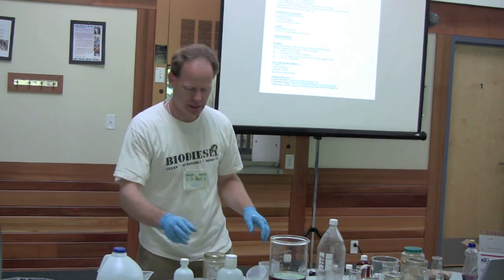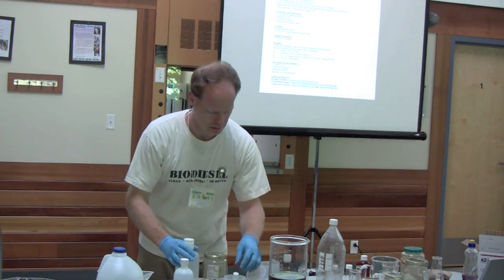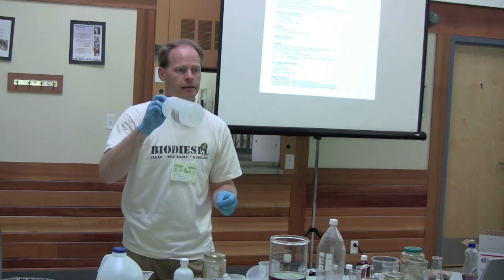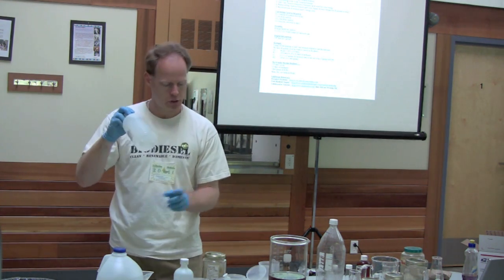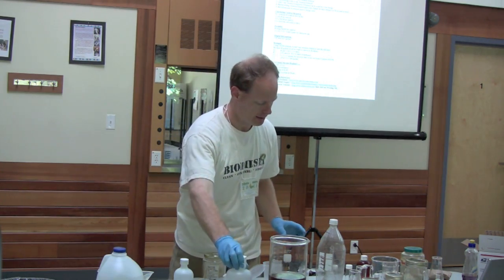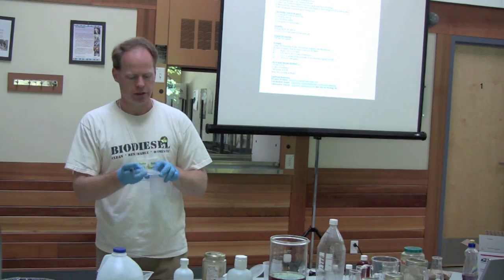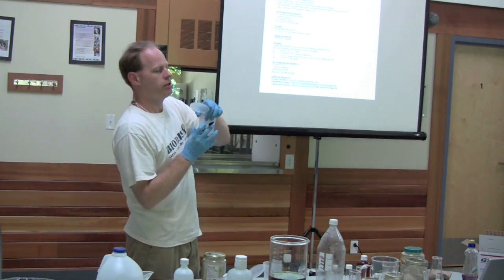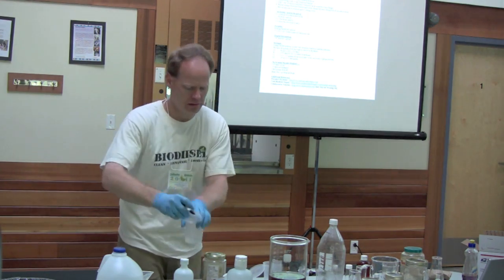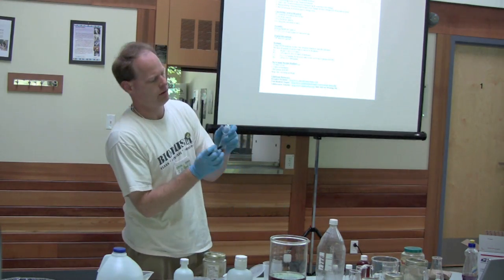Okay, our next step is we take some of this that we've made and let's titrate. You haven't added your indicator solution yet. Pardon? You haven't added your indicator solution. Yep, I'm just putting some in a cup so I can suck it out. Oh, okay. I like to take my little cups that I'm doing this with and label them. This is alcohol. We were using oil here.